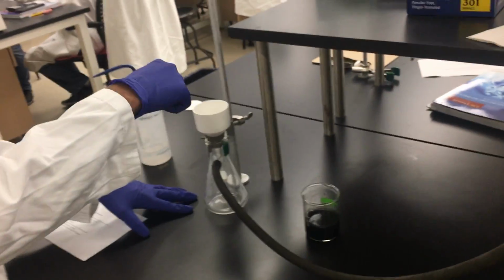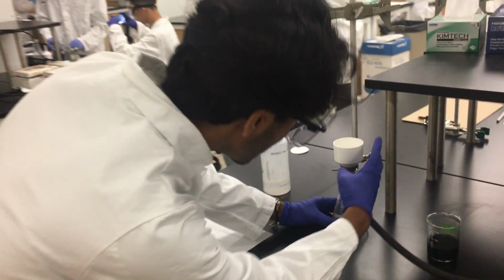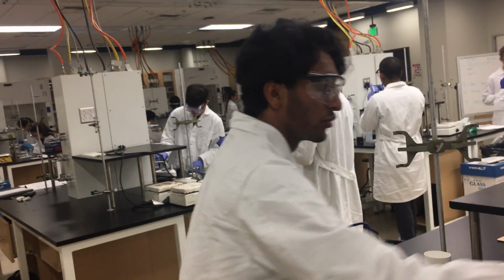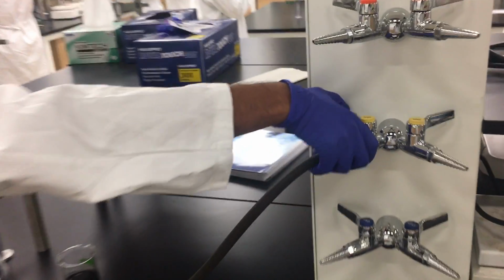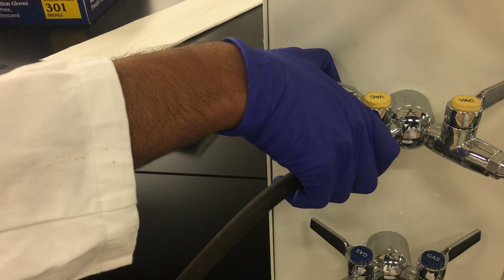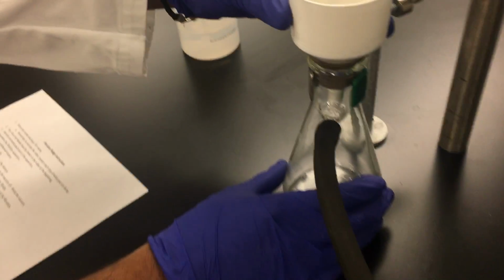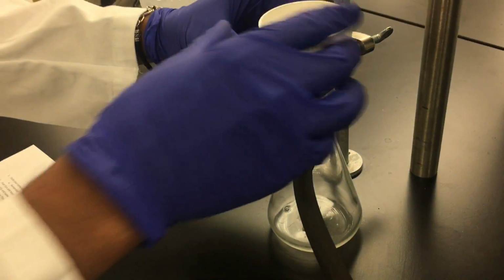What I'm going to do now is start by turning on the vacuum so I can suck out some of the water that's already there. You're going to see the filtration is going to really suck the water that's consistently there already to the bottom of the flask. So I'm going to turn the filter vacuum on. And as you can see, it sucks the stopper and all the water down. The filtration paper is drying up top, and we're going to keep this on.